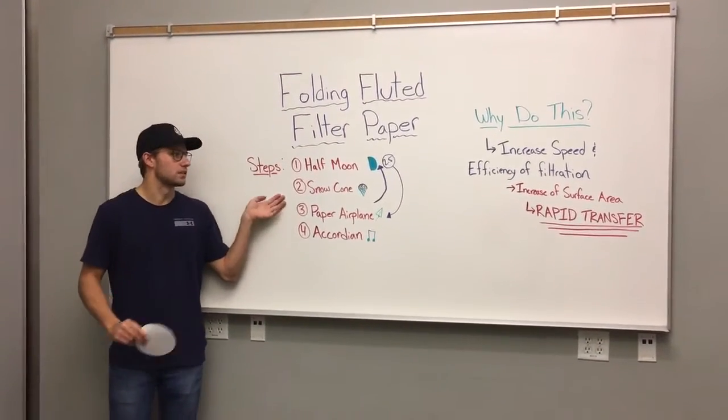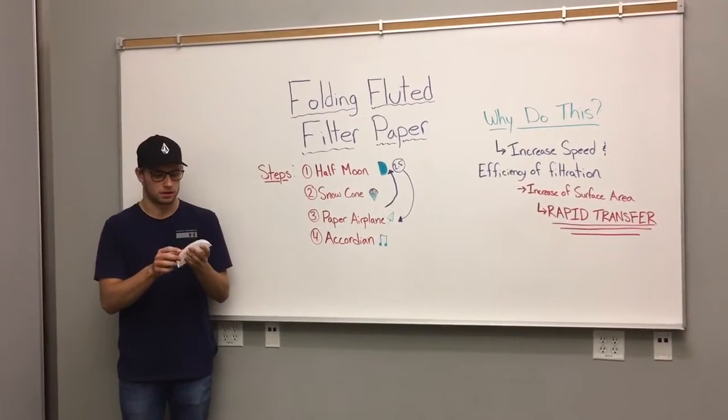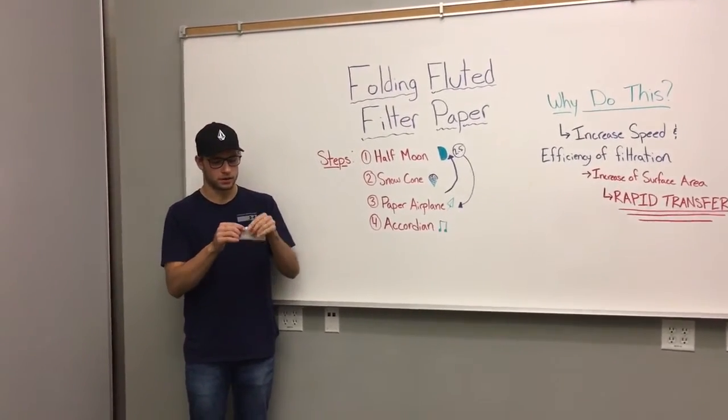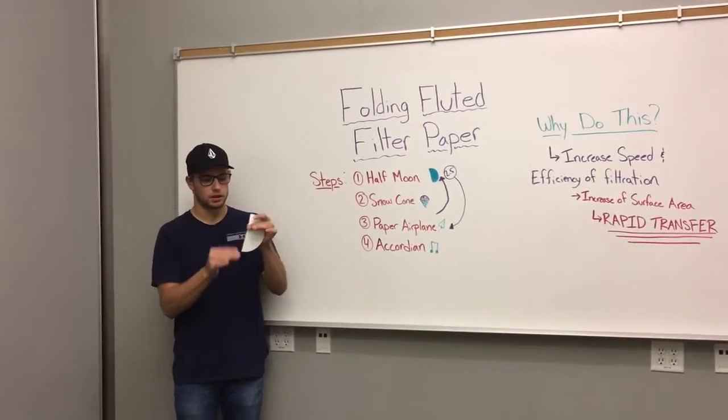Alright, so we have a couple steps. In our first step we want to make a half moon with the filter paper. All I'm going to do is simply fold it in half, line up the edges, and crease the edge.